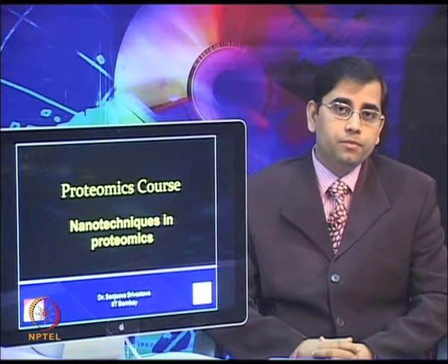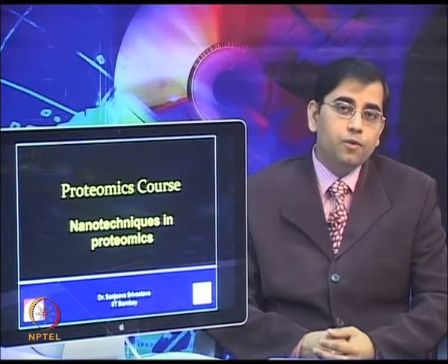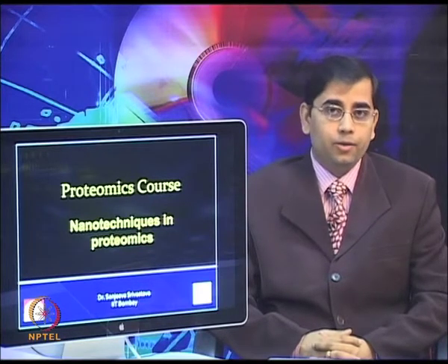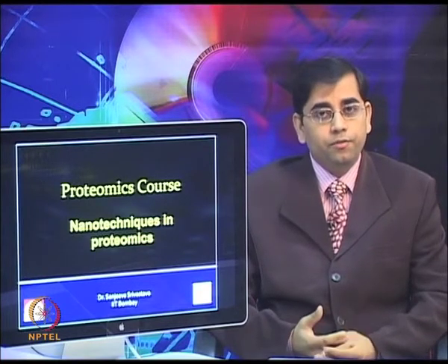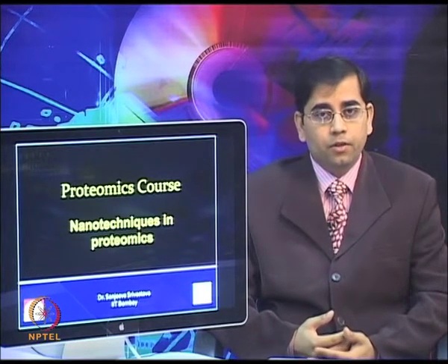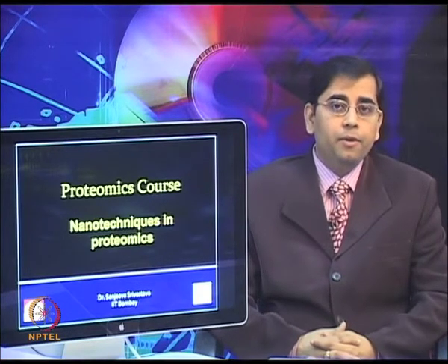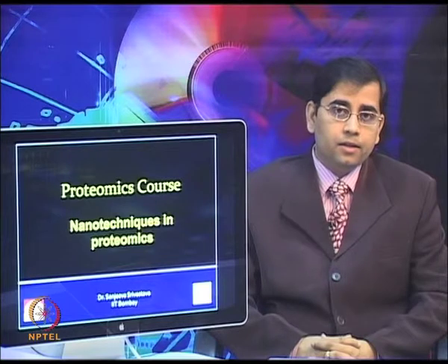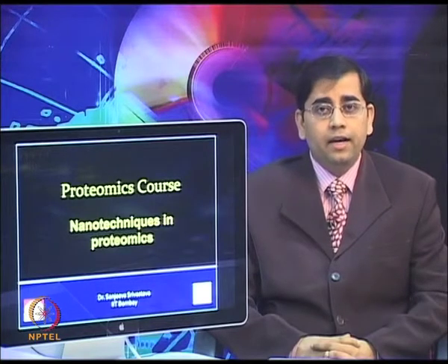We then discussed microarrays, different types of microarray platforms, including conventional protein microarrays and cell-free expression based protein microarrays. Then we started discussing different types of label-free techniques. In the last few lectures, we focused more on new and different label-free methods, such as surface plasmon resonance, surface plasmon resonance imaging, ellipsometry, interferometry and different types of platforms.